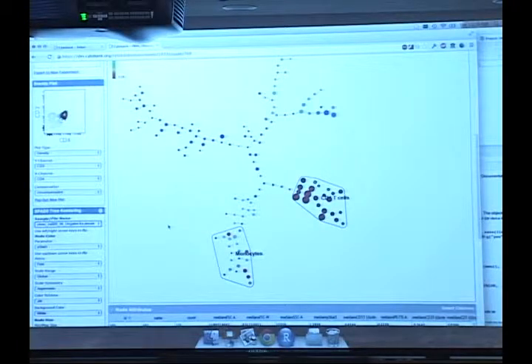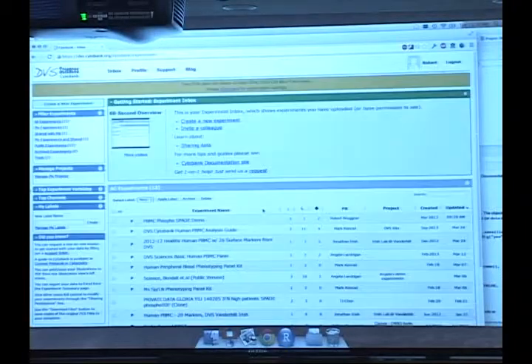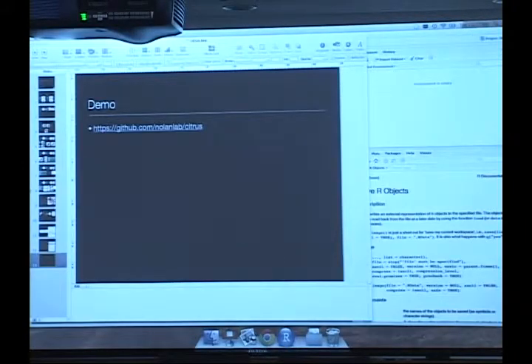So in the interest of time, I'm going to stop here on this particular subject. Do you guys have any questions about using this interface, what you can show, how to represent different pieces of information that you might be interested in asking? OK, you can always ask at a later point, too, if you have questions. OK, so I'm going to close that.